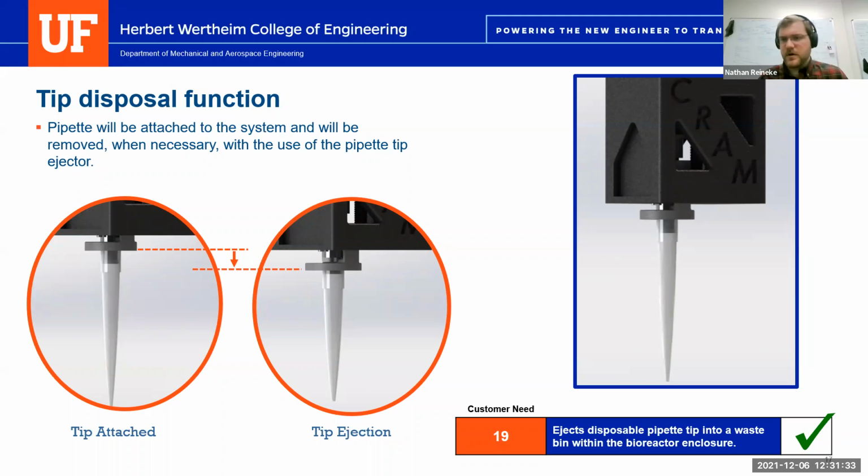So I don't think we need a human interference. We would need an apparatus, which we assumed was going to be part of the housing team requirement, that would allow us to lower this apparatus into the next pipette tip and then do whatever. So not manual, but not a part of your system.